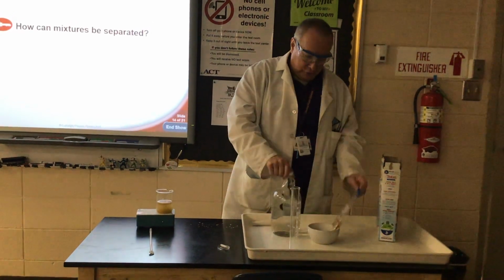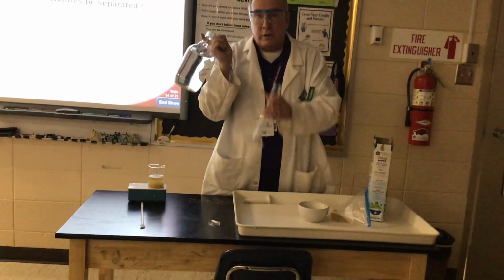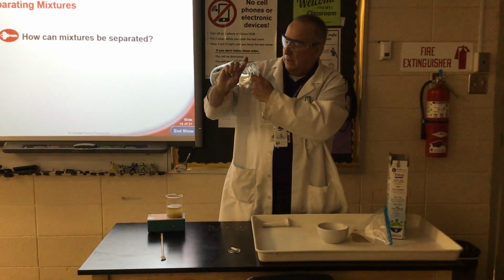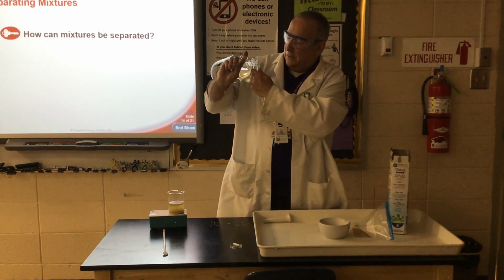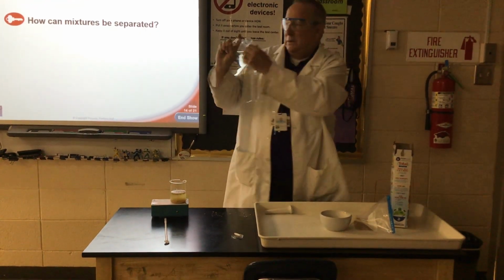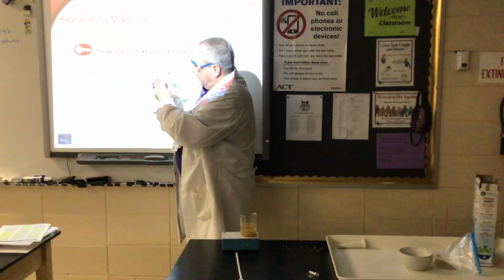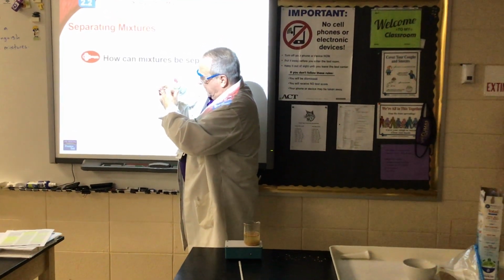And I'm going to measure out 100 milliliters of water from my water bottle of purified, distilled, deionized water, my glass bottle, and I'm going to get in the light so I can read my numbers better. I'm pouring it into a 100 ml graduated cylinder.